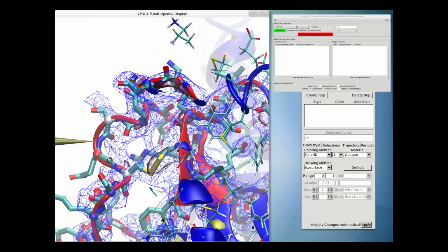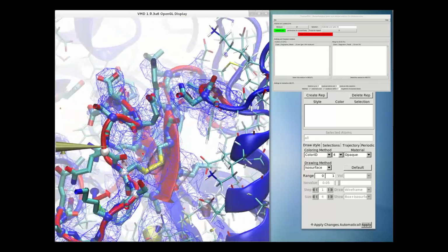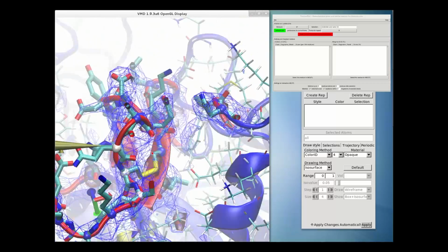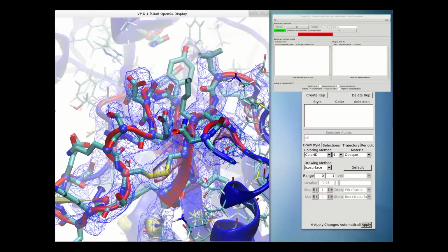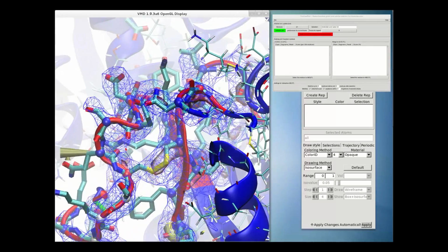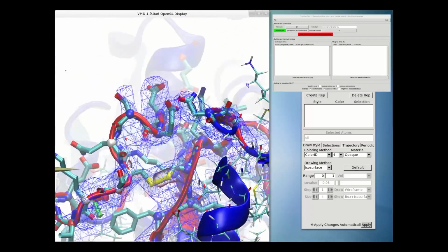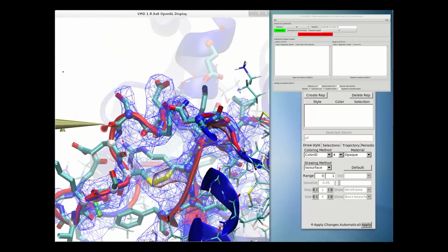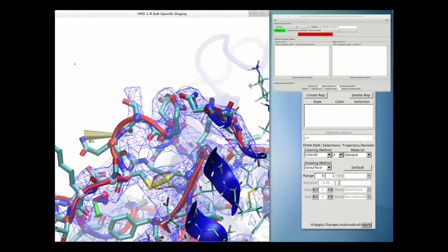The yellow right-pointing cone is the internal representation of my haptic interface, which I'll be using extensively throughout. This tool allows me to effectively reach into the simulation, grab and pull any atom, and have the simulation respond accordingly while I feel it pulling back at me. This makes the remodeling process highly responsive and intuitive, and allows me to rapidly explore a wide range of conformations to find those that are both consistent with the density and structurally reasonable.